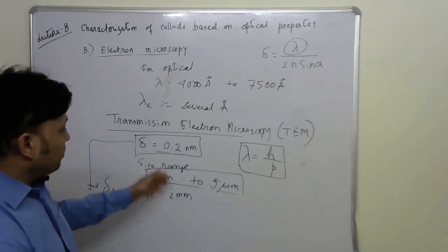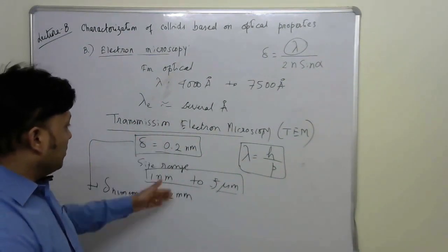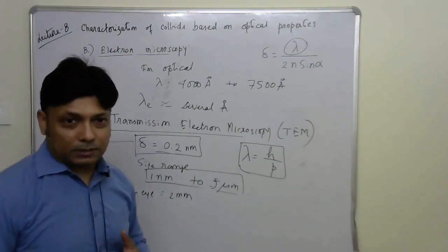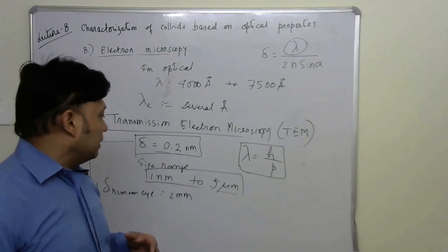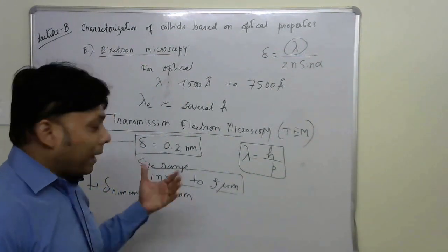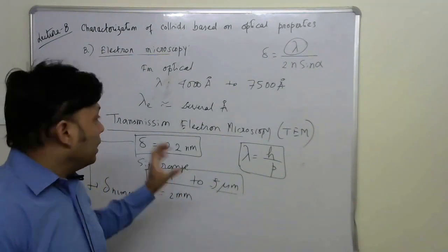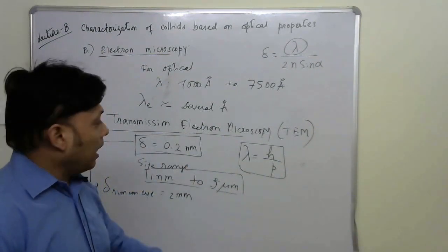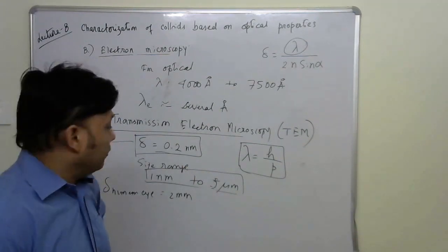So you can see the magnification is actually going in millions. Several hundred thousands or even a million times magnification is required. In transmission electron microscopy, those electromagnets actually make such magnifications.